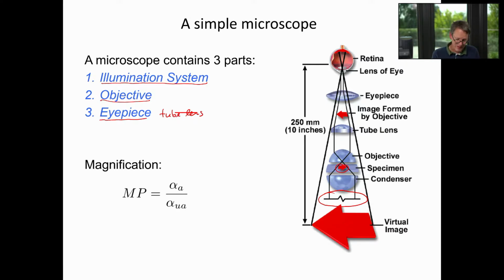It captures the light coming from the sample. And then here is this tube lens. So the tube lens forms then a real and magnified image, and you could then put a camera somewhere around here. For example, if you put a camera here, that's essentially what an optical microscope is. So really the important part is the illumination system, the objective, and the tube lens.